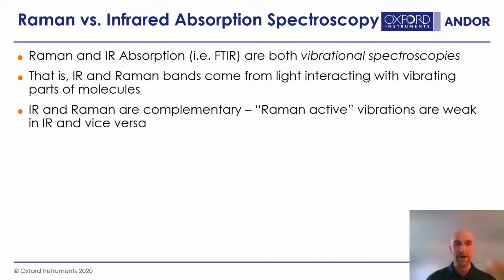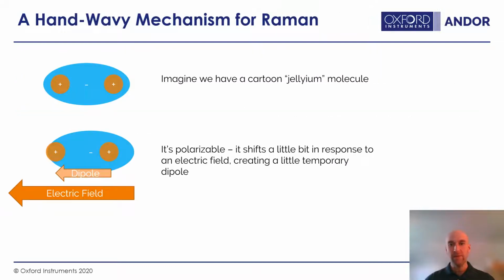So IR and Raman are complementary. Raman active vibrations are weak in IR and vice versa. So let's talk about why that might be. And I'll give you a very hand-wavy mechanism for Raman scattering.